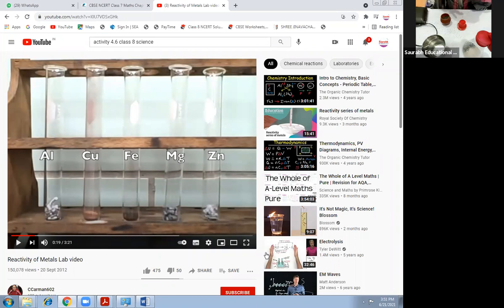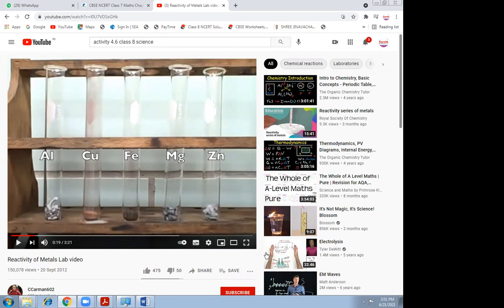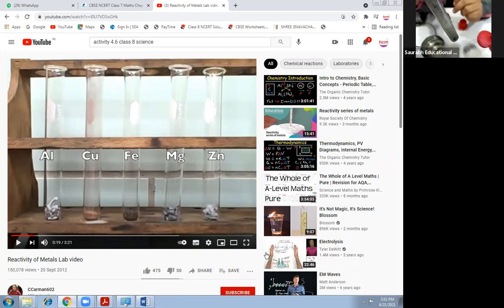Balloon gas. Yes, it's produced. Now see, inflating. Gas is coming out of it. Can you see it? Yes sir, a little. Yes, this one. See, it started reacting. Yes. And balloon is filling now.